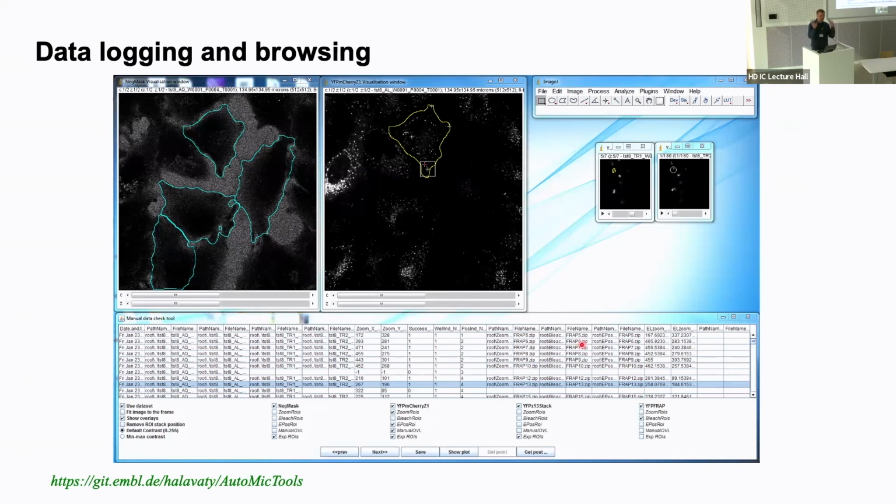With a simplistic interactive interface, one can scroll through these images and actually see or control what kind of decisions the microscope made, whether it was right, whether it was wrong. Especially when you debug the workflow, and you don't know whether the microscope did the wrong job, or the analysis did the wrong job, or whether both. So it really helps us to understand what the missing points are, especially when you tackle errors which do not appear frequently.